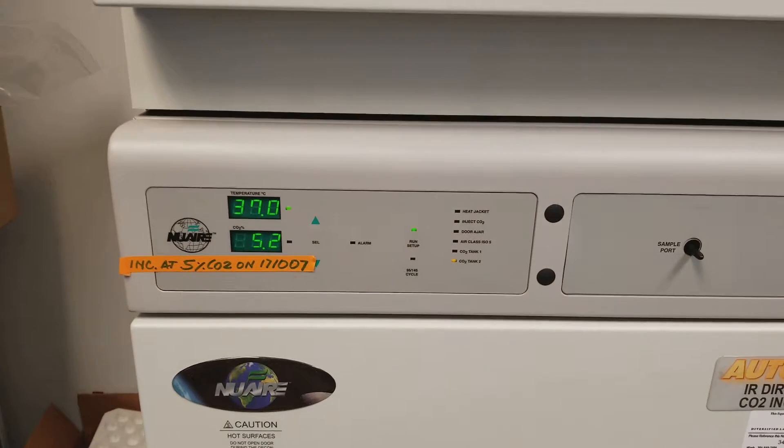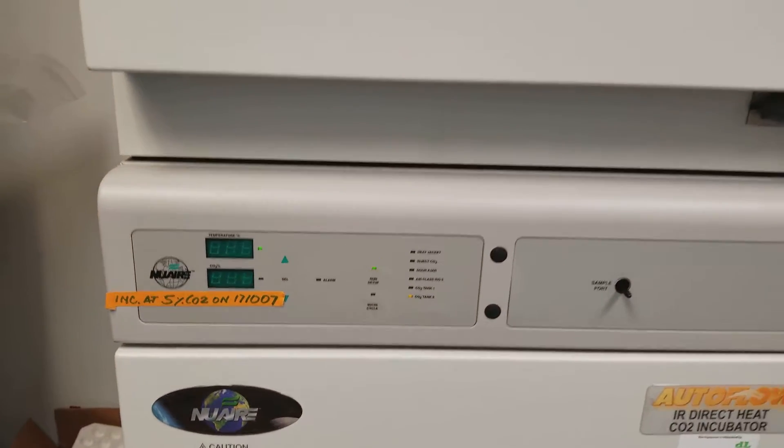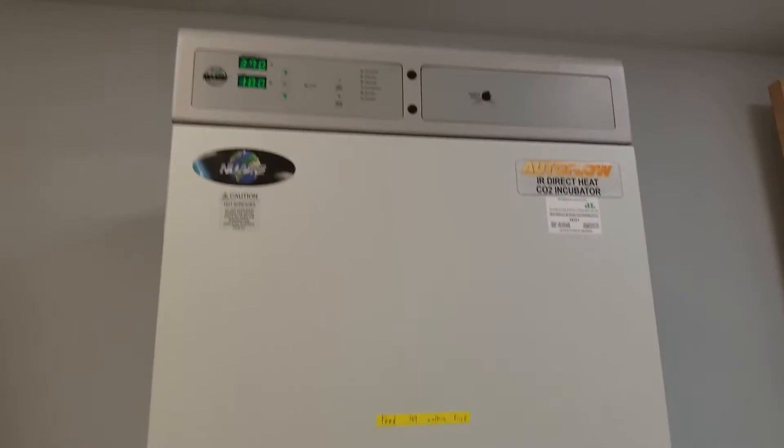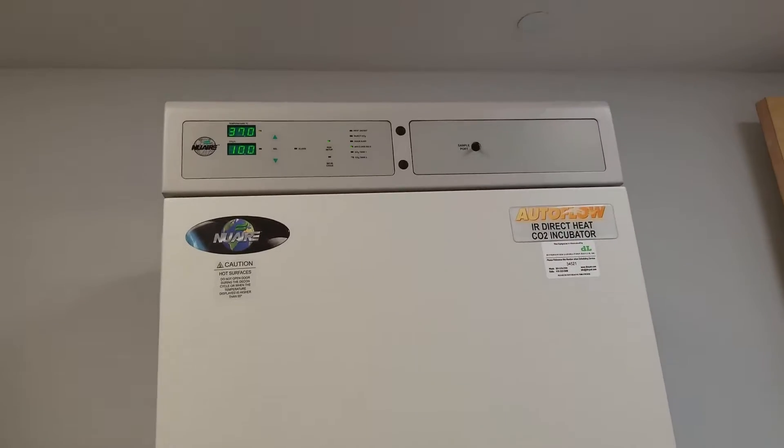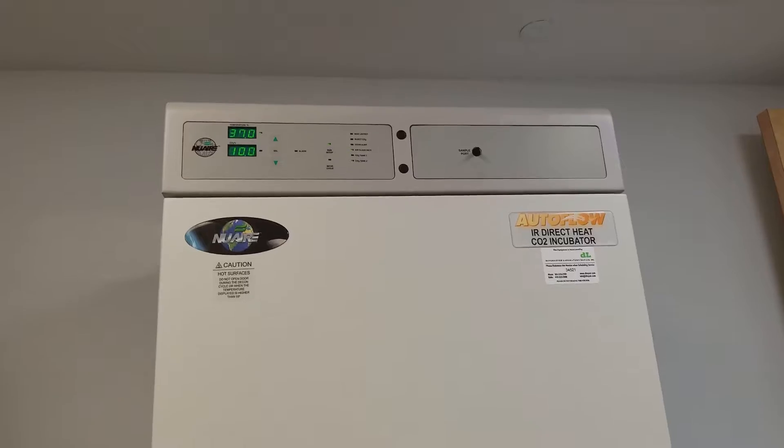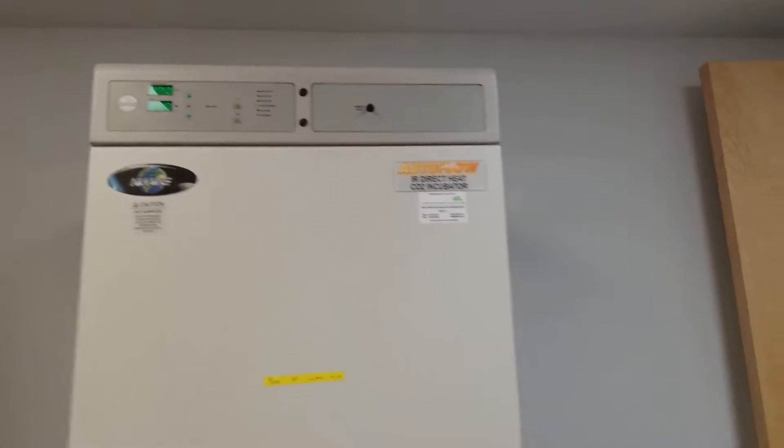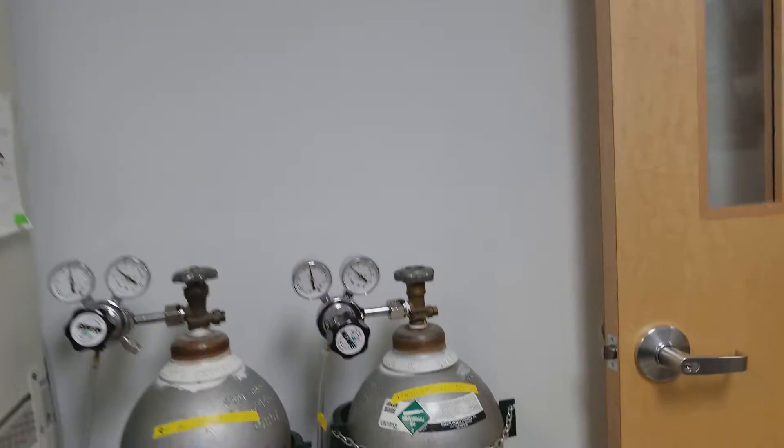This is blinking but it's not alarming, so I'm assuming it's okay. This is not blinking, which looks also good.